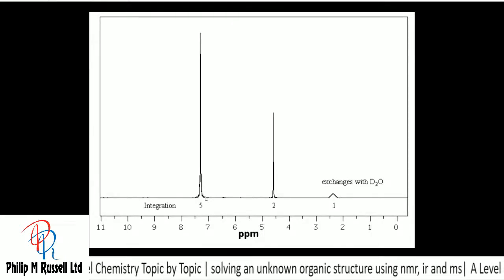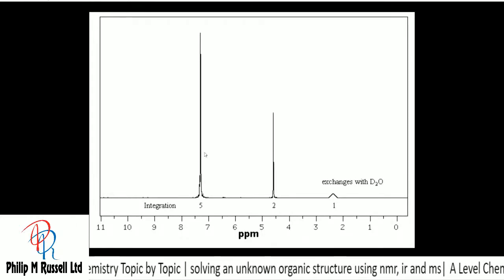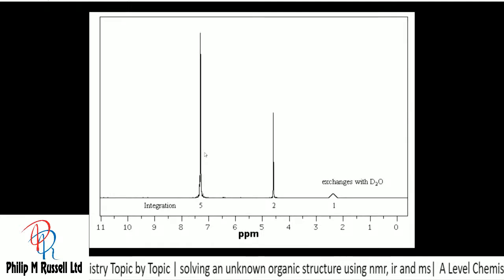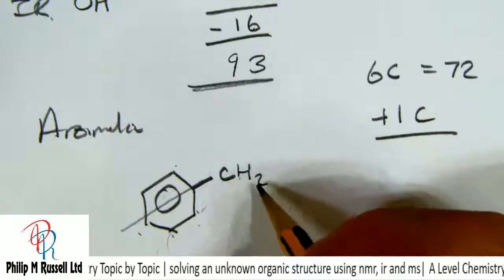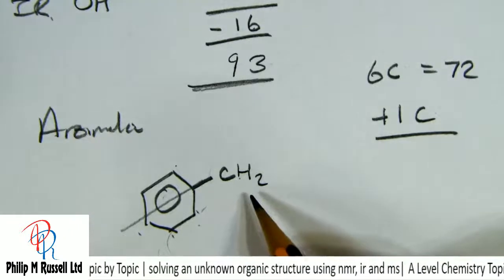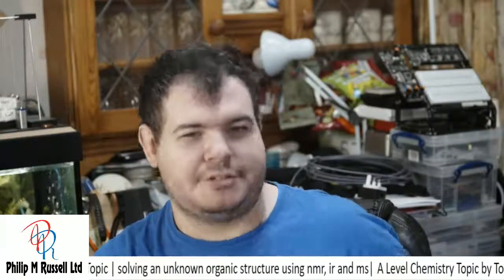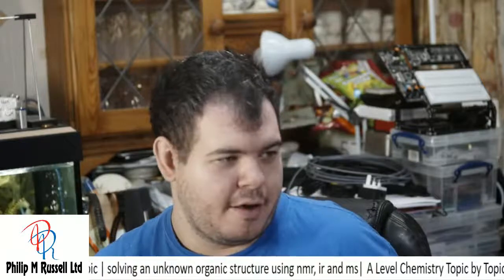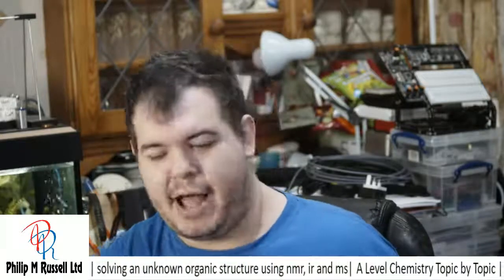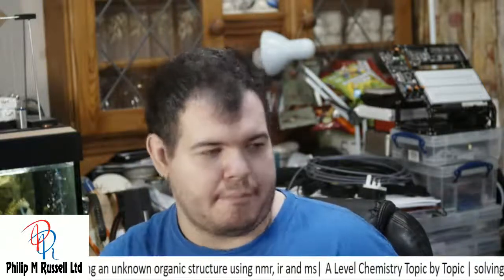So we basically got this singlet here. Integration. So we got an integration here of 2. So we got a CH2. So my reckoning then is that's got to be that one. That's got to be a CH2, and the reason they're all singlets is because they're the same environment. All the protons, they all match the same. You can't tell one from the other. So the N+1 rule breaks down because they're all given the same peak, because they're all the same. They look like the same. Okay.